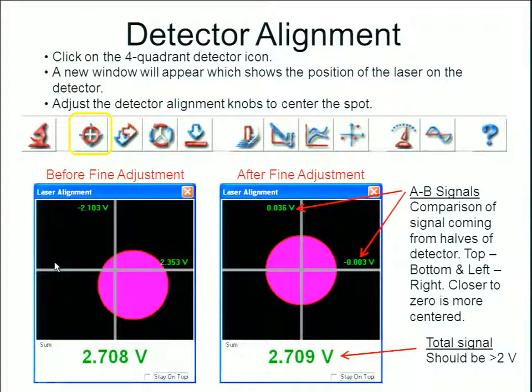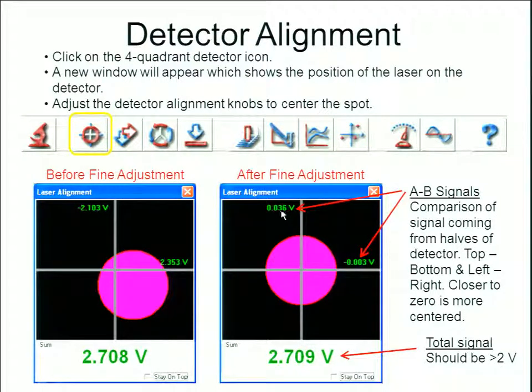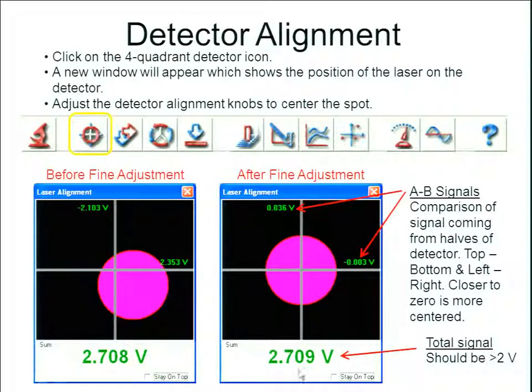Then make adjustments on your detector. Move the knobs to rotate the second mirror and get the laser adjusted onto the detector. You want to get close to center, then use the software to look at the actual voltages. Centered would be absolute zero — 0.000 — so get as close as possible and verify that your total signal is of adequate voltage.